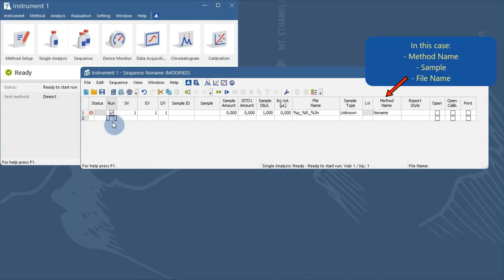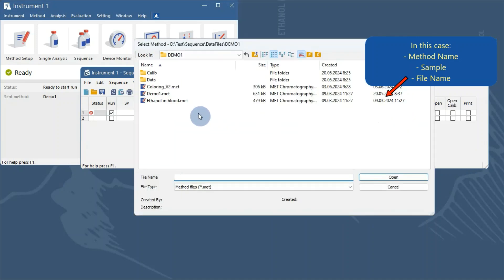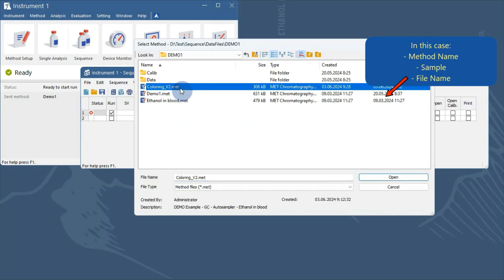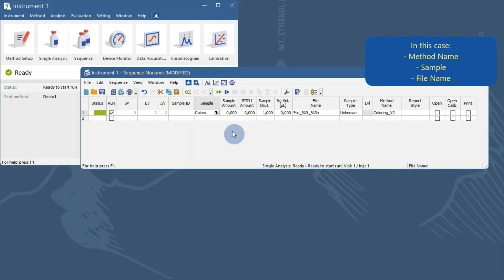I will fill in the method name and sample cells, as these will be the same for the whole sequence. In the file name, I will change the variable from sample ID to sample.